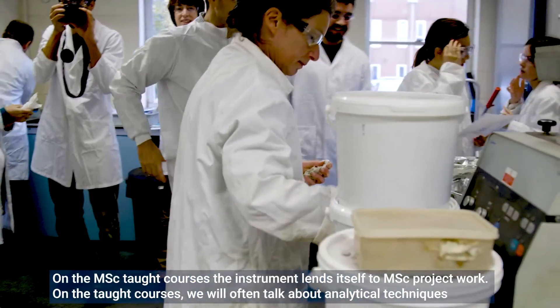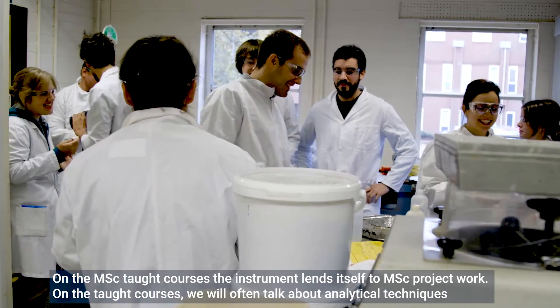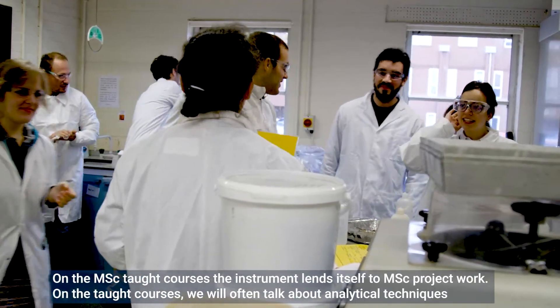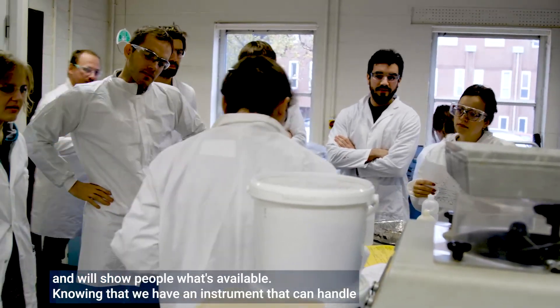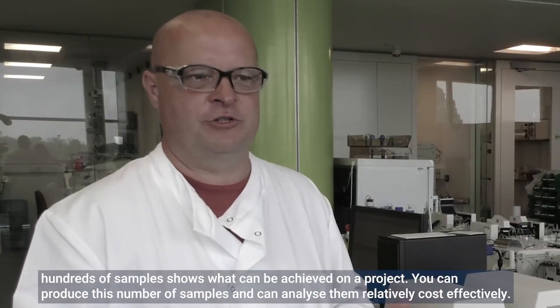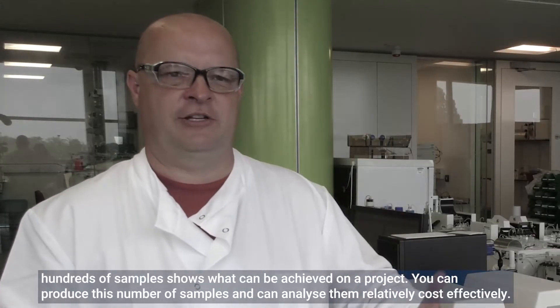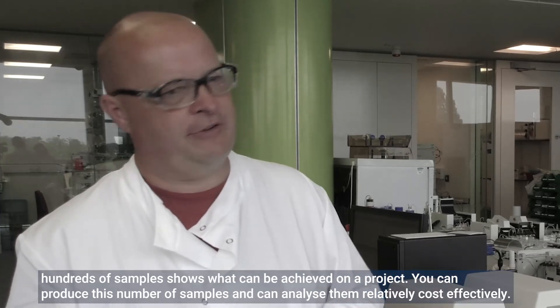On the MSc courses this instrument tends to be used more on MSc projects. On the taught courses we often talk about analytical techniques and show people what's available. Knowing that we have an instrument that can handle hundreds of samples means that on your projects you can produce large numbers of samples and analyse them relatively cost-effectively.